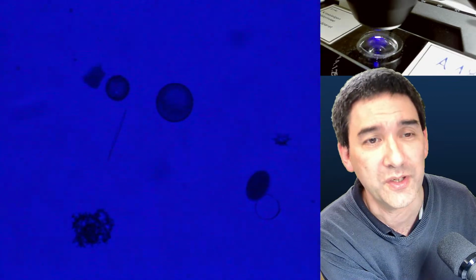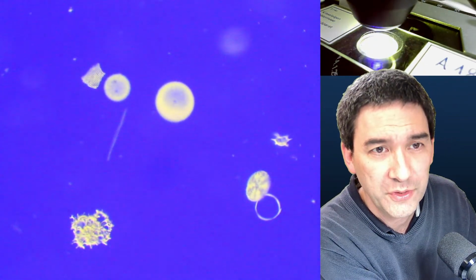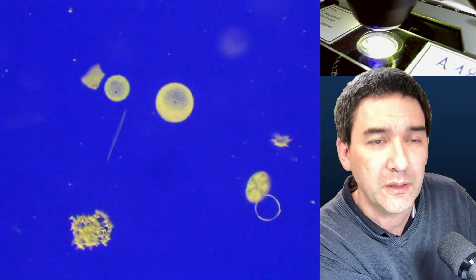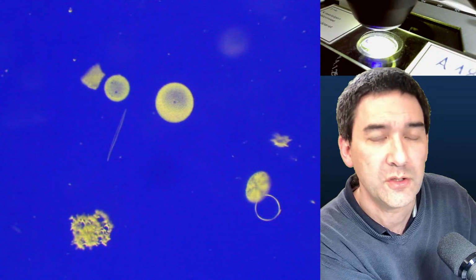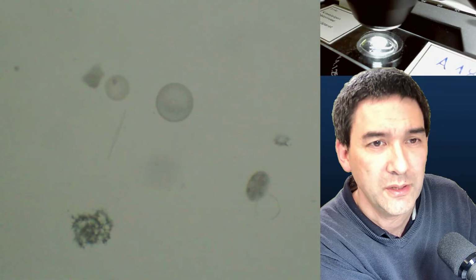I have to, of course, raise everything. Just a second. I have to open the condenser. You always open the condenser. I forgot to open it, and this is how it looks like. It kind of looks a little bit blurred, blown out because it's too bright, right? So let's compare this again. So that is with the filter, and that is without the filter. Okay, so you do see a pretty significant change here.